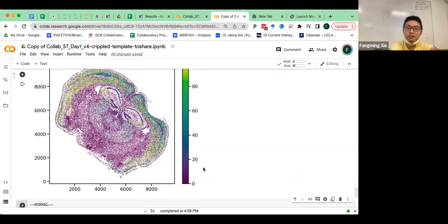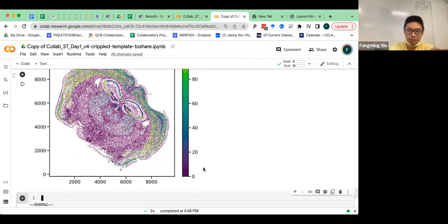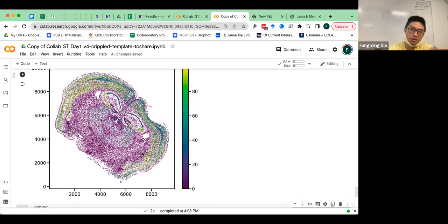For tomorrow, we talked about naive analysis today, but that's actually half of the battle for a complex data analysis: to visualize your raw data as much as you can and understand what's inside. But tomorrow we'll go into more detailed computational analysis methods to see how we can extract information better and get something more than this spatial distribution and gene expression.